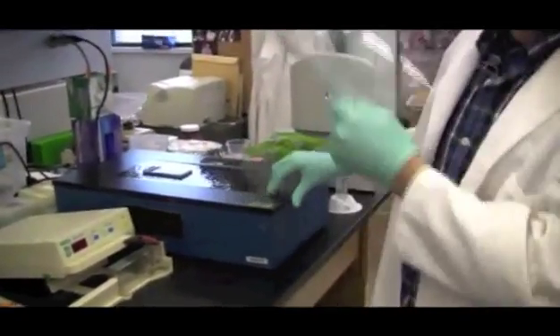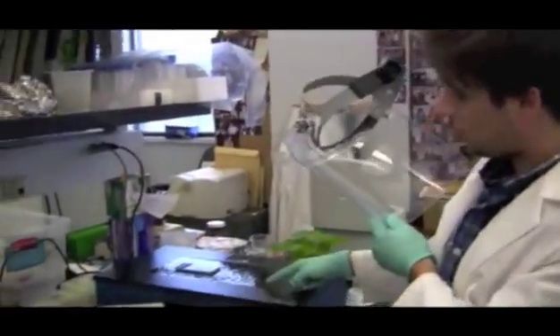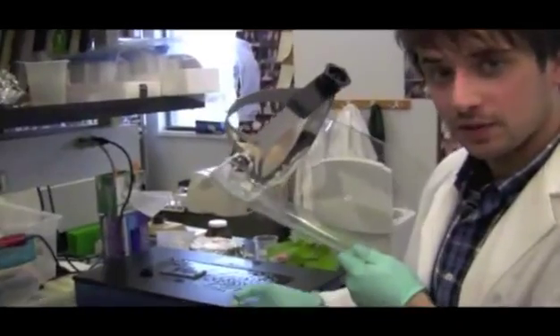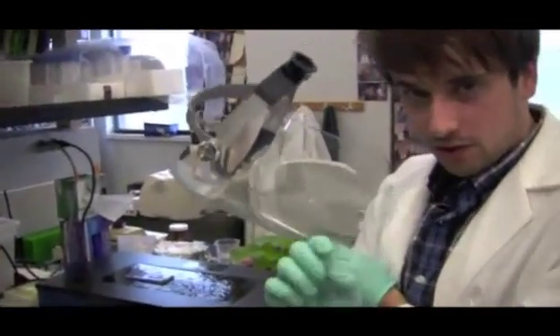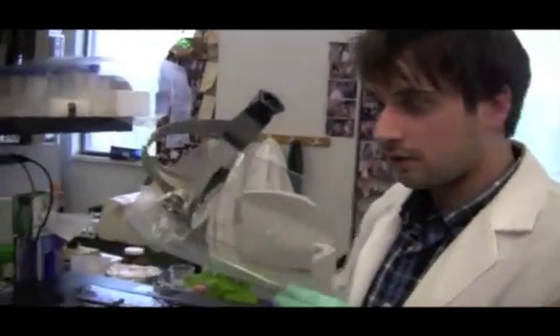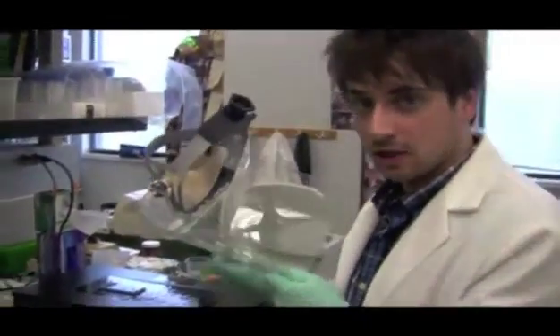So now, what's happening is there's UV light being shown from the bottom of this box, and so that is reflecting off the DNA. So if it was dark enough in here, you guys might be able to see through the camera, but I highly doubt you're going to be able to. So I'm going to cut out just that tiny little 750 base pair band that you guys saw on the video screen. And I'll show you an image of what this would look like in the dark in one second. First, I need to cut this out.